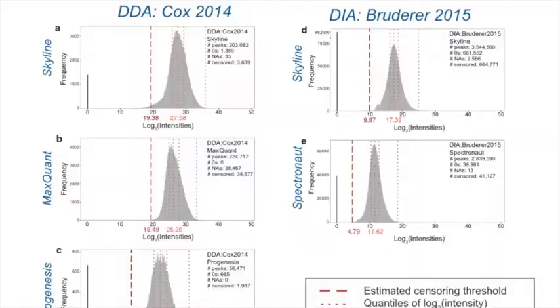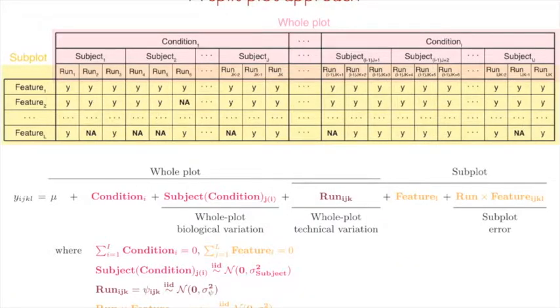But before we do that, we need to consider missing values. This is something which we found is quite important for us. So we need to find a way to handle missing values. And this is really important because missing values can occur for multiple reasons, right? They can occur because we have peaks which are so overlapped that we cannot quantify individual peaks reliably. Or we can have missing values because the analyte was below the limit of detection. In which case, we don't have the number, but it's not arbitrary. We know that it has to be low, right? So it's not just any possible number. And so we need to distinguish this.